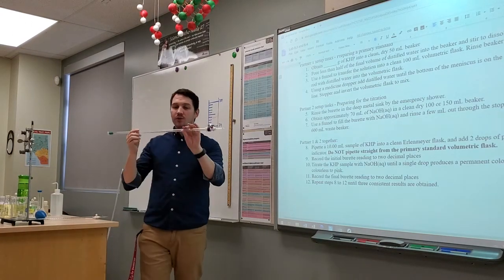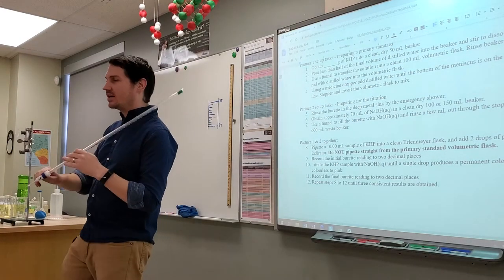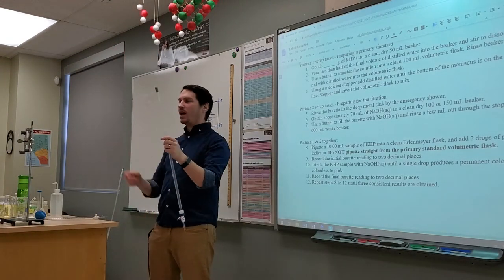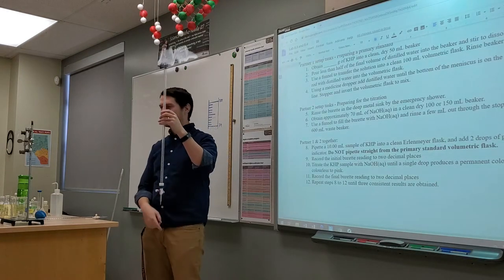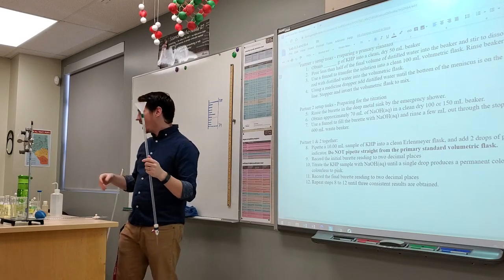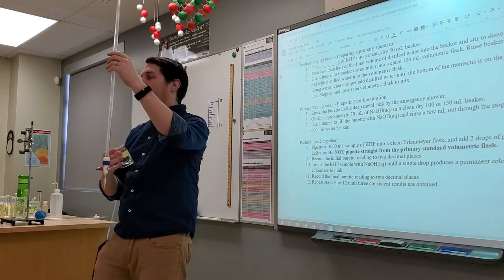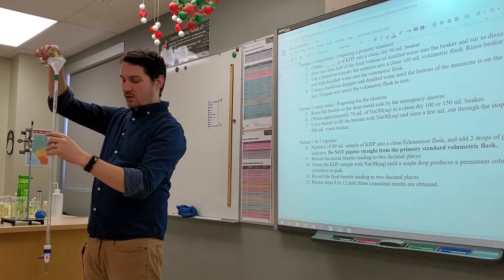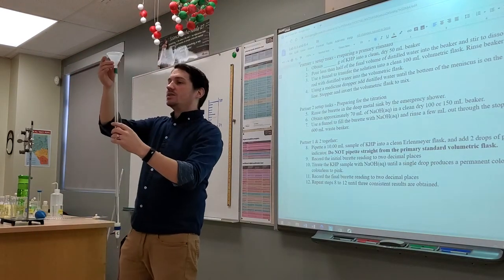And what do you want to do before you actually start using this thing? Yeah, you've got to rinse it out, right? So close your valve on your stopcock, because what's going to happen if you start pouring water or titrant in here and it's not closing? Yeah, it's going to start coming out the bottom, right? So take your funnel, and you're just going to add some of your sodium hydroxide, fill it up maybe 5 or 10 milliliters, okay? So you're just pouring it in here and watching it down there. Good. Totally fine.